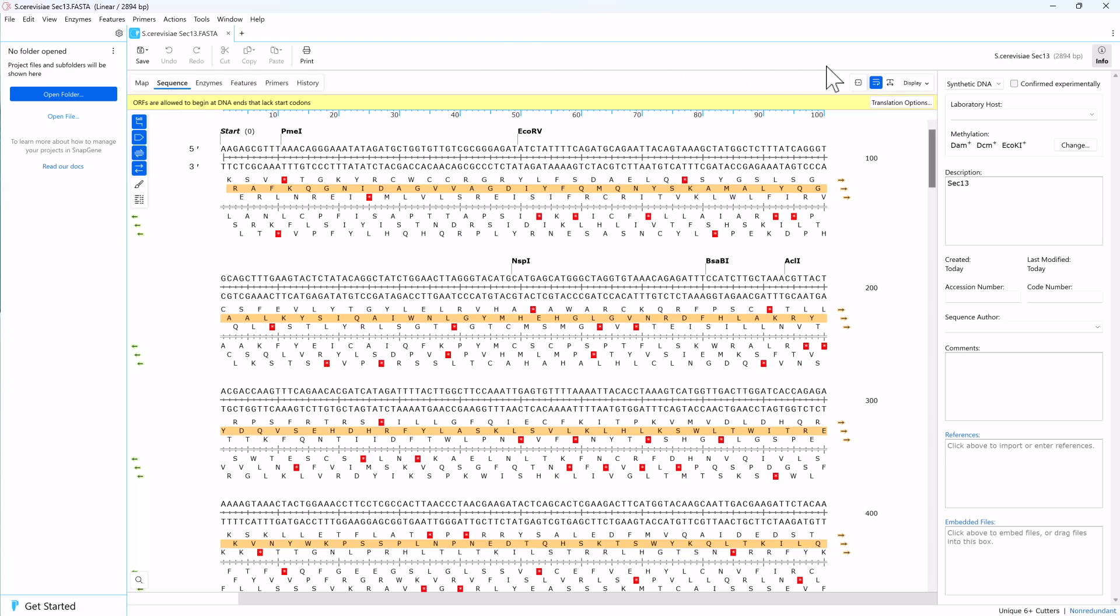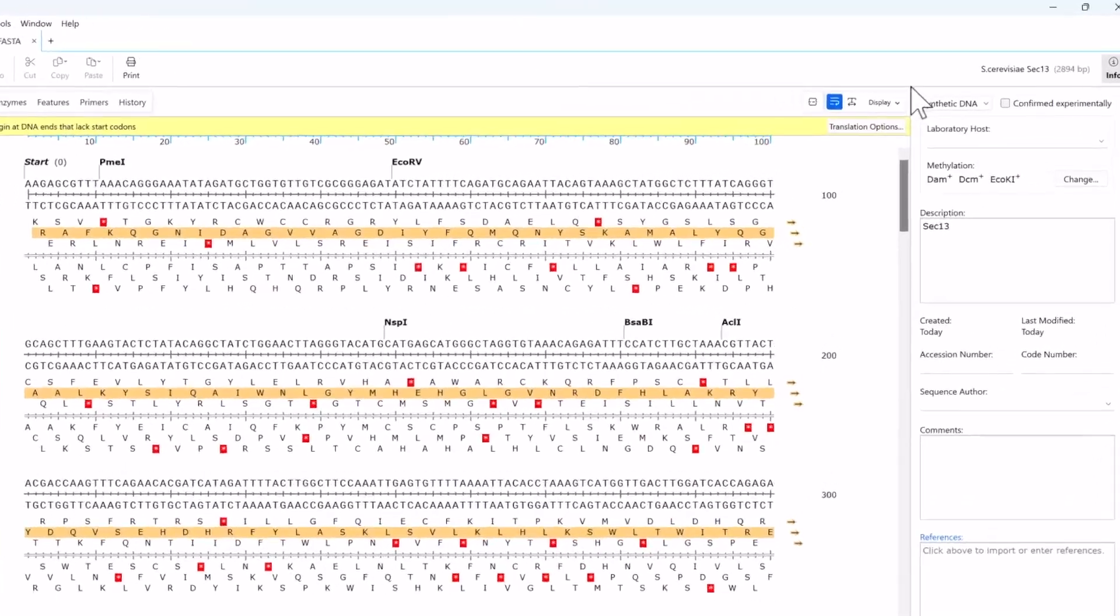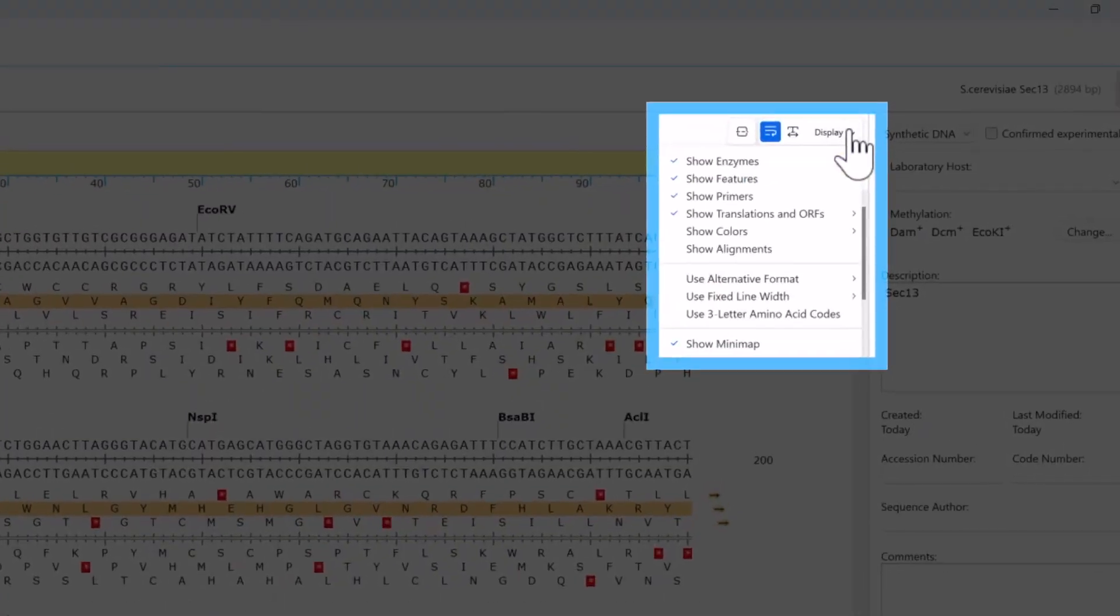The display drop-down in the top right corner allows you to display the three-letter amino acid codes.